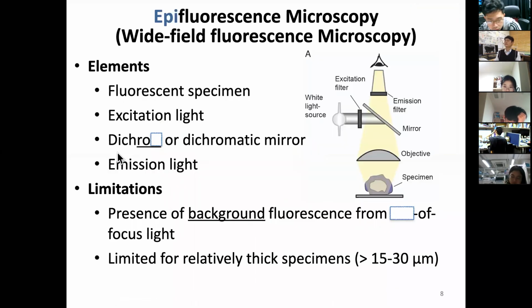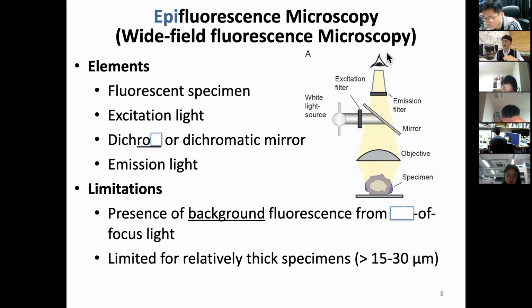Okay, so now we have an understanding of fluorescence microscope, but I have to give you a little bit more. In this situation, you have a specimen, you notice that we shine the light from top to bottom above the sample, and we take the image on top. So we call this an epifluorescence microscope. Epi means on the surface, okay? So you are shining from the top.